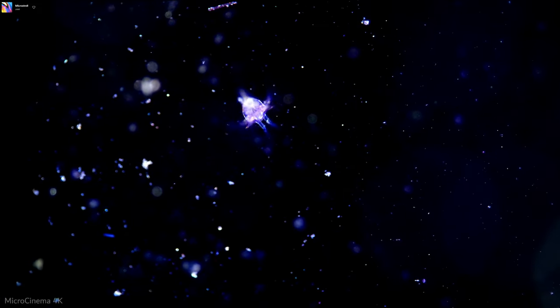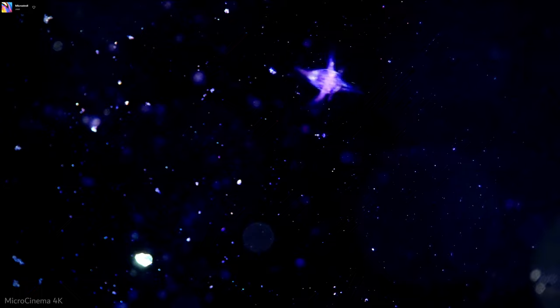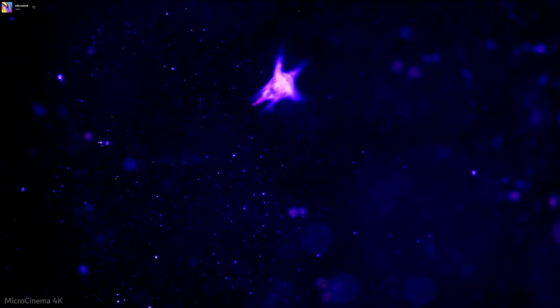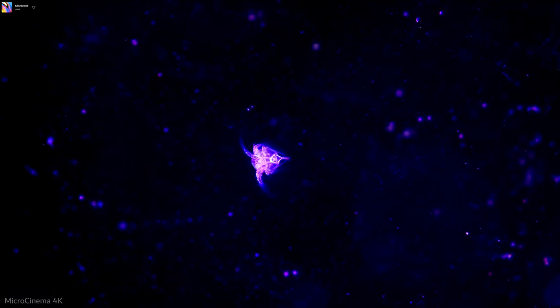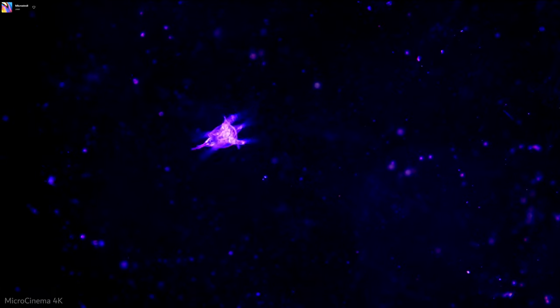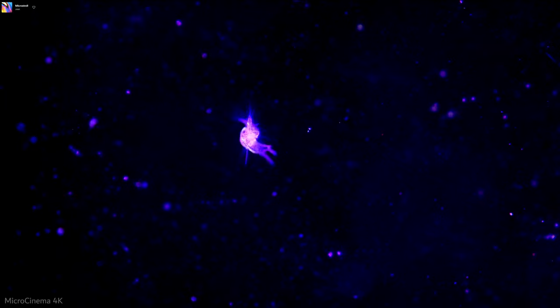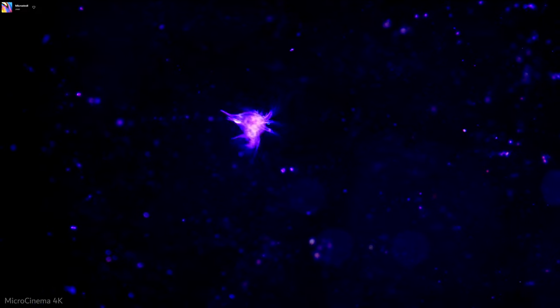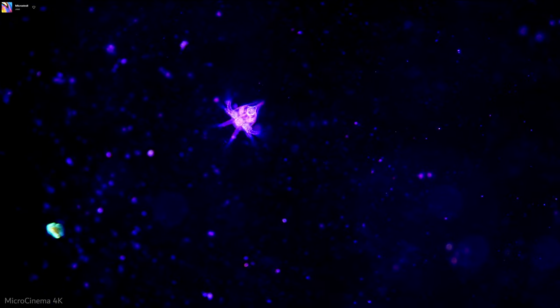One of the first things I did when I got my Journey of the Microcosmos microscope is I modified it with a 5 watt, I think it was like a 9 watt LED. That thing is hurt your eyes territory. But it's really nice for techniques like this. And it also generally improves your video quality because you can expose at lower ISOs.